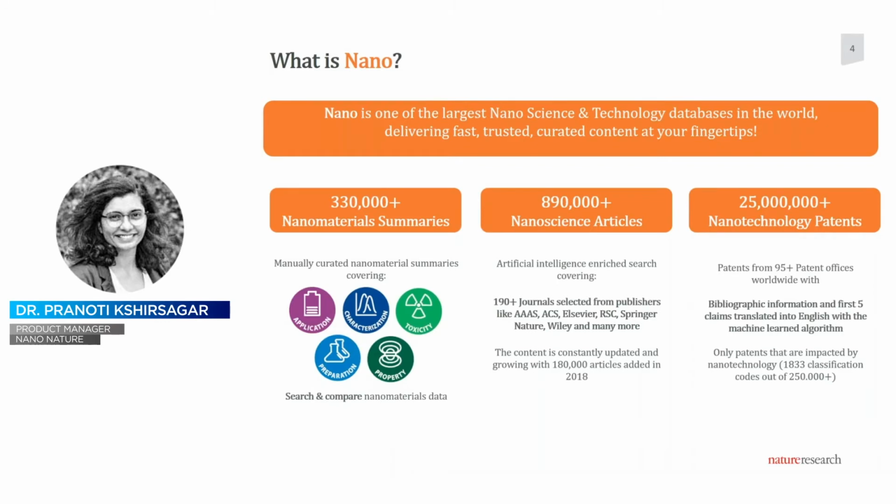For all three of these categories that you see on the screen in front of you, we heavily use artificial intelligence, and in some cases we also combine it with manual intelligence. We can talk more about it. If you do have questions, I'm happy to go into more detail. However, for the time being, I would like to walk you through the three different types of content you see in front of you.